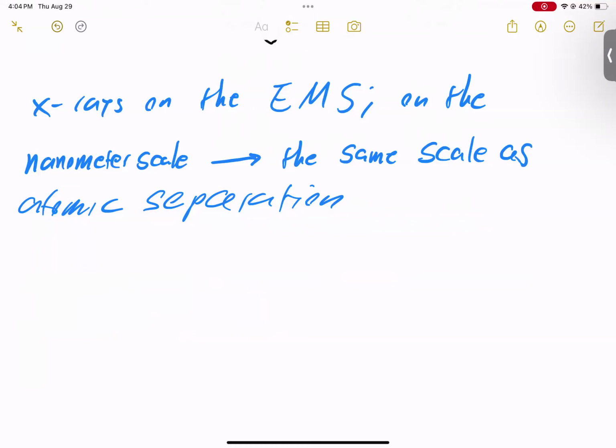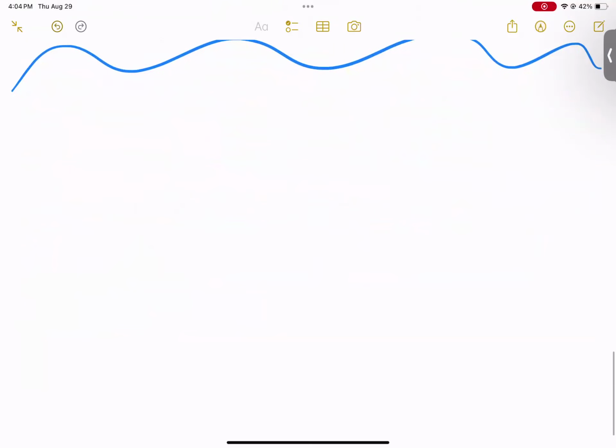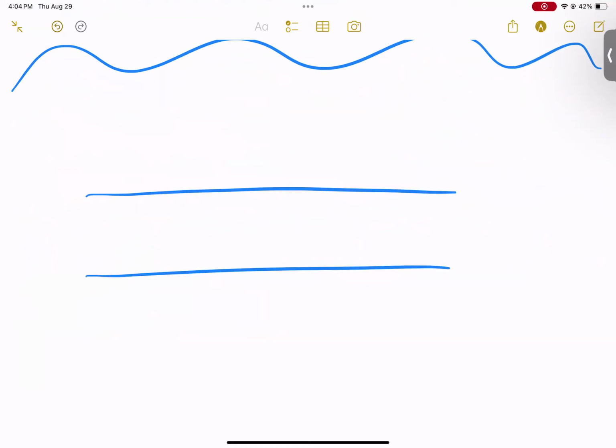So let's go look into the deeper parts of X-ray diffraction and what that looks like. So when it comes to X-ray diffraction, the way it works, let me draw this. This will take a while to draw. And the points I'm drawing are the actual atoms within a crystal plane. So these are the atoms within the crystal plane.